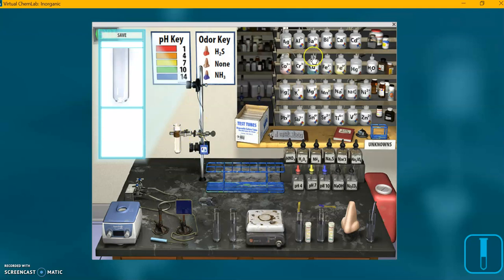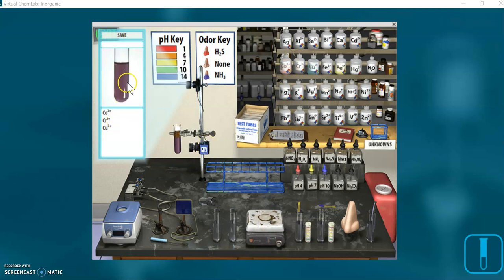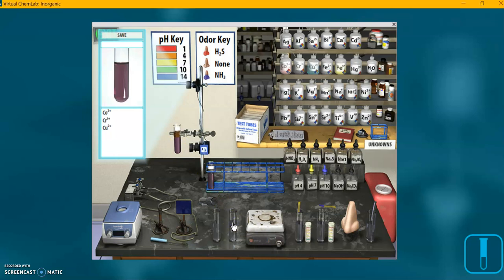Once you've got a test tube there, everything is awake and activated. As it says on your worksheet, I'm going to put in the Cobalt 2+, Chromium 3+, Copper 2+. Over in this area we have the zoom-in view so you can see what the solution looks like. Since this is a known solution, it tells us exactly what is in there. Just clicking on them fills the test tube — you don't have to drag anything over. I'm going to duplicate what we have here using the Divide function, which creates a copy of our original in case we make a mistake.